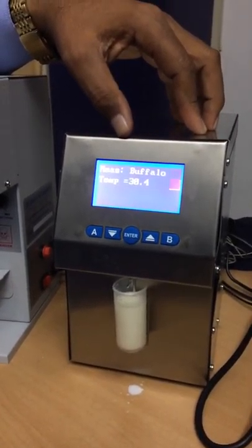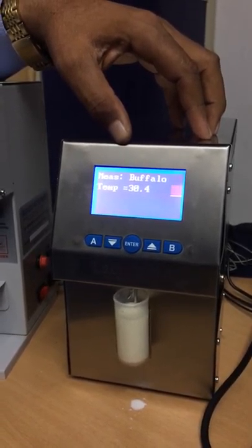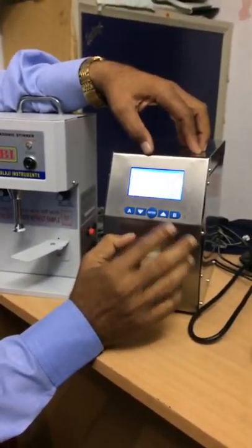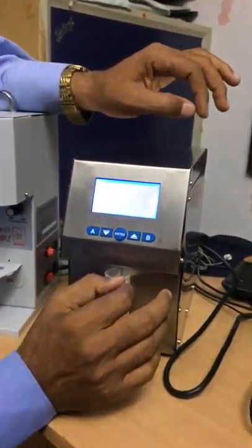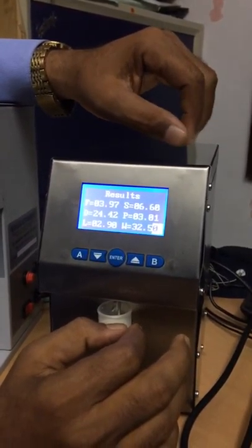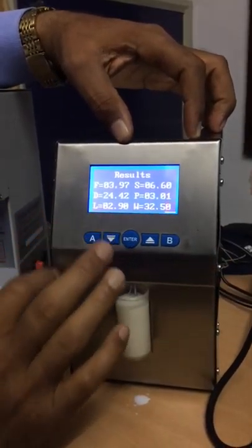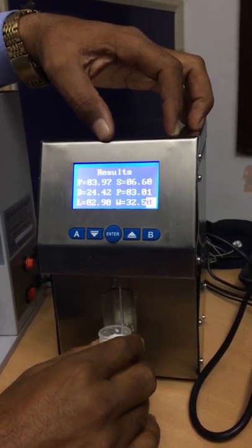The milk temperature will be a little bit high. Next I will show you how to clean the machine. On the back side of this milk analyzer there is one RS-232 protocol plug through which you can connect this analyzer to a computer or data processing unit.